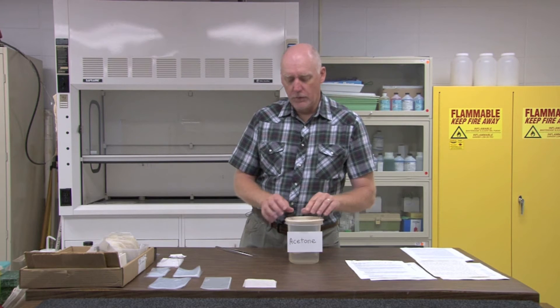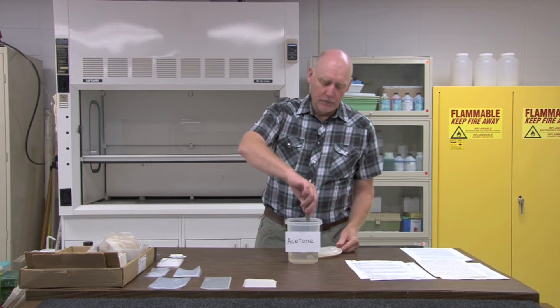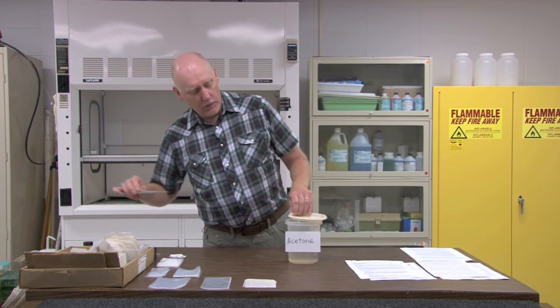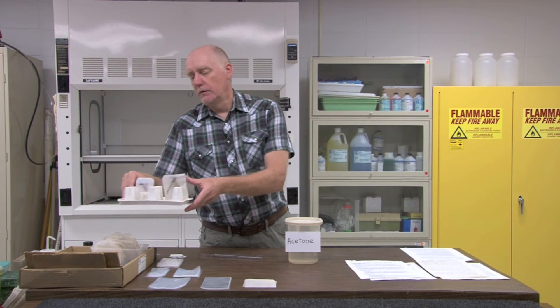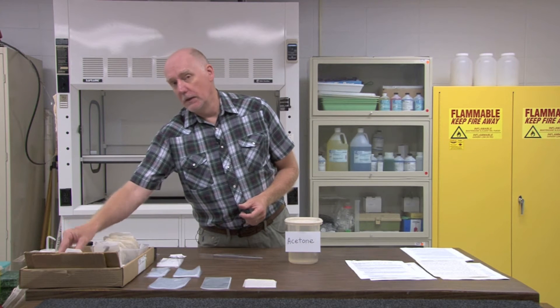Soak the specimen for at least eight hours — I generally soak my specimens overnight. After you've preserved your specimen overnight in acetone, use your long handled forceps to remove the envelope and allow it to air dry. I begin the air drying process by just placing the envelope on a grid and letting it dry out for about thirty minutes before I try to take the specimen out of the envelope.